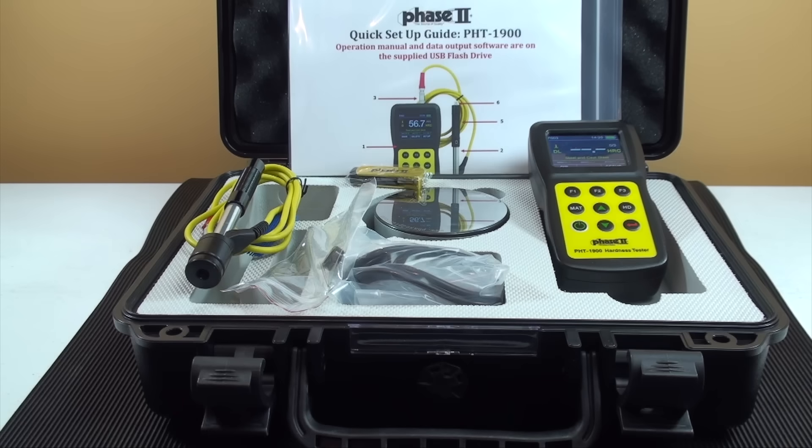Should you have workpieces that are not close to such mass, contact Phase 2 and inquire about our ultrasonic portable hardness testers. The next parameter is surface roughness. Surface roughness should average a 2 micron or 80 micro-inch finish or better using the standard impact probe. Optional probes such as the G probe can handle rougher surfaces such as on rough casting.